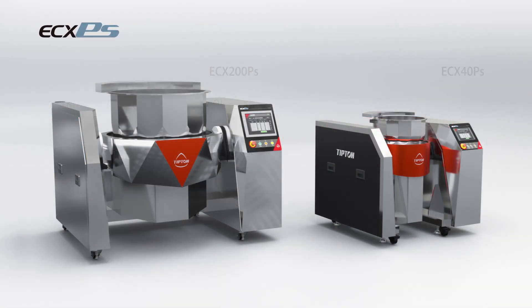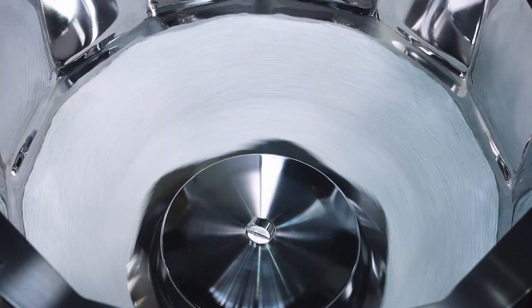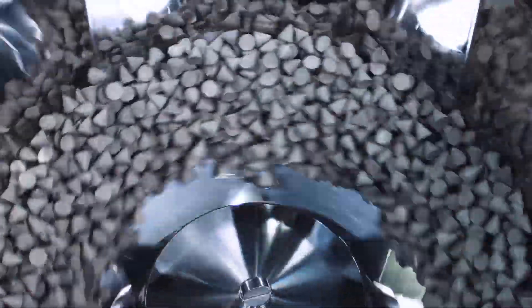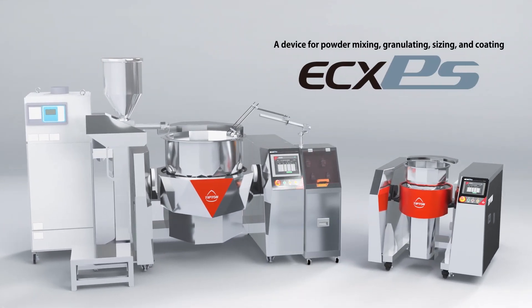Furthermore, Tipton can customize designs based on customer needs. With over 80 years of equipment design and development technology at Tipton, we can help our customers turn their ideas into reality. ECX Ps is capable of multipurpose processing for even the finest particles. Experience Vortex Flow with stable, powerful stirring capability from another dimension, made possible by two of Tipton's patented technologies.